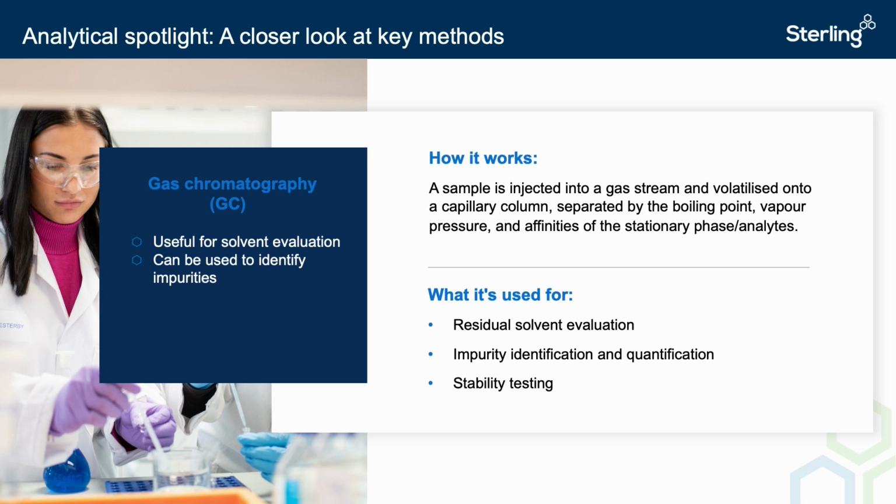A thermal conductivity detector, or TCD, is an alternative detector for samples that would not work well with FID detectors or are difficult to ionize. These are used for siloxanes and light hydrocarbons and can have operating temperatures of 400 degrees C.